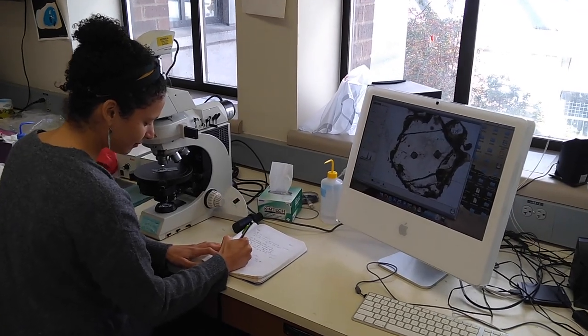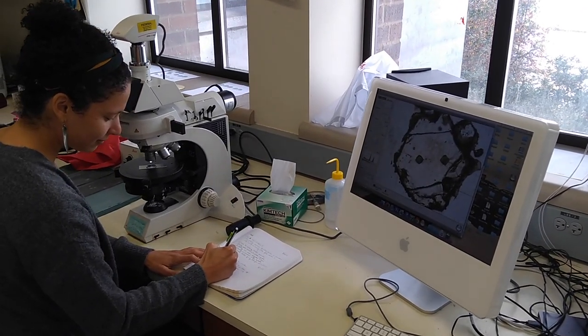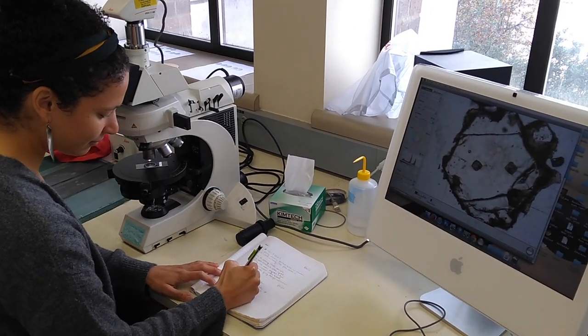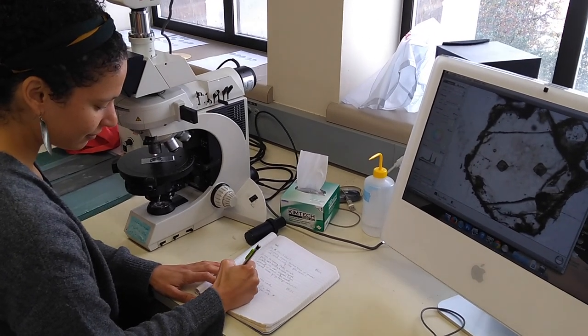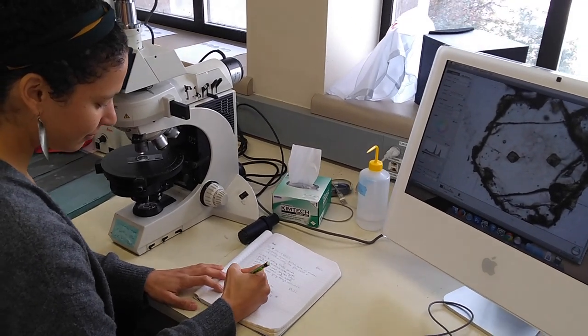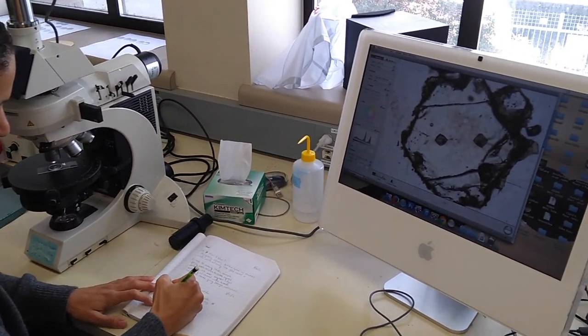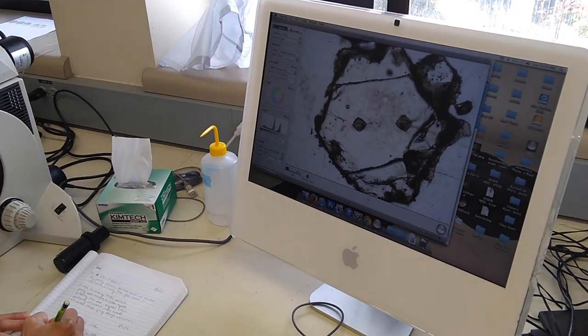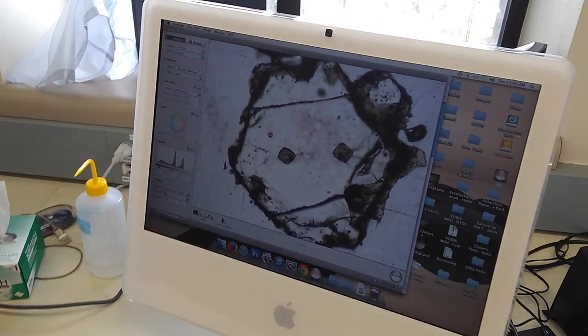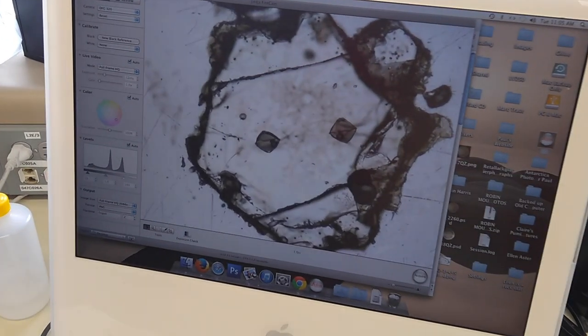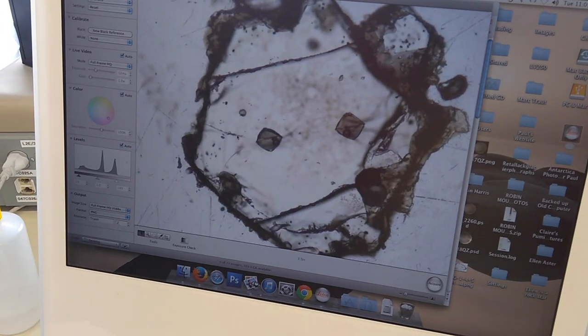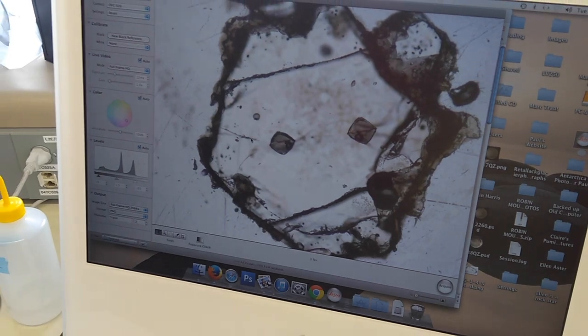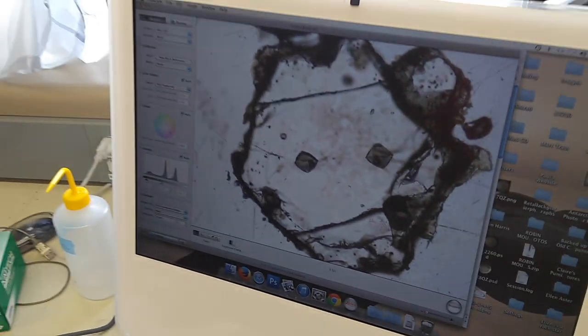We carefully inspect our exposed melt inclusions and document any features that might be important about their size, various features such as vapor bubbles or fractures or daughter minerals that are present.